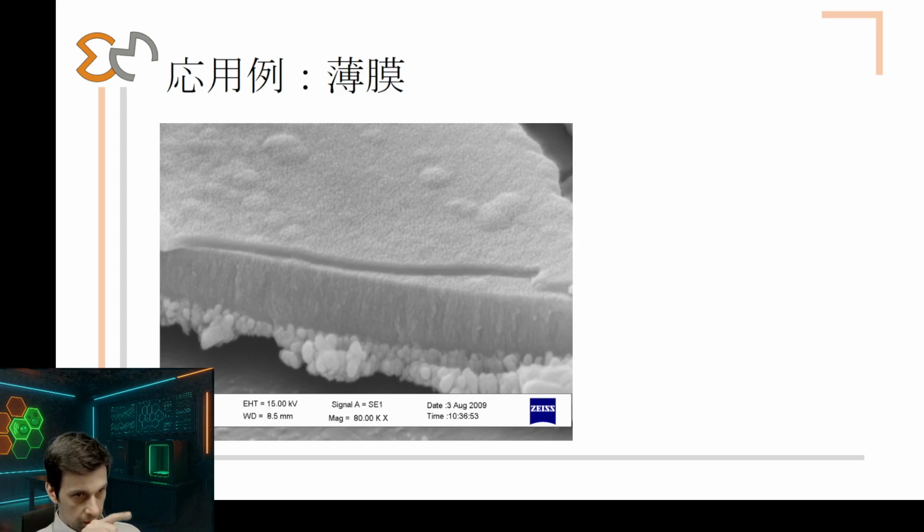It's because of the shape of the substrate. And if you focus a little bit more on the small coating, the one that I told you is about 100 nanometers, you will see that there are two layers, one a little darker, one a little lighter. This is because this special coating is about 45 nanometers of titanium oxide and 45 nanometers, sorry, the first layer is aluminum oxide and the second layer is titanium oxide. And this is used for corrosion protection. It's extremely powerful, extremely thin. It's probably the tiniest coating that can be used for corrosion protection.